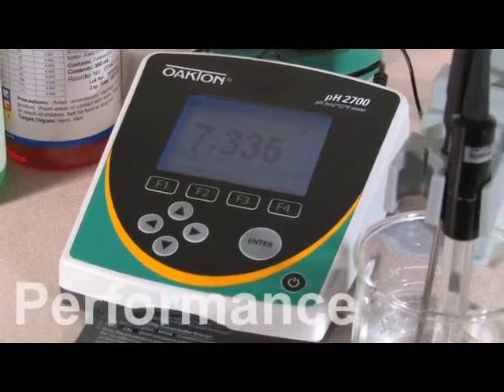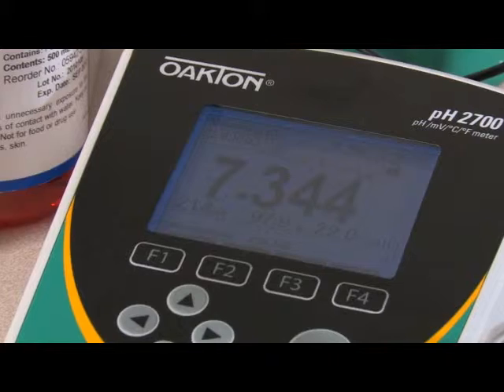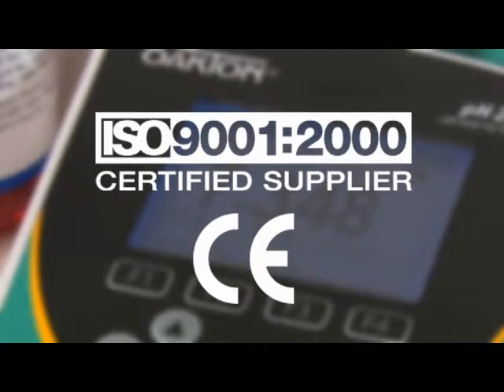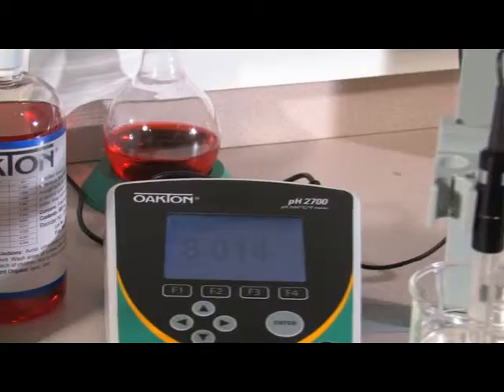For more than 20 years, Oakton Instruments has set the standard in water testing instruments. All our 2700 series meters are designed and manufactured in an ISO 9001 facility, are CE marked, and carry a 3-year warranty. With the new 2700 benchtop meters, we've set the standard again, combining your most needed features with the reliability of the Oakton brand.